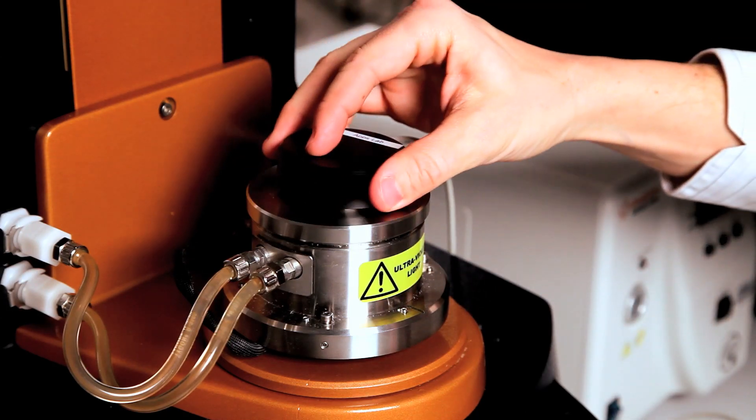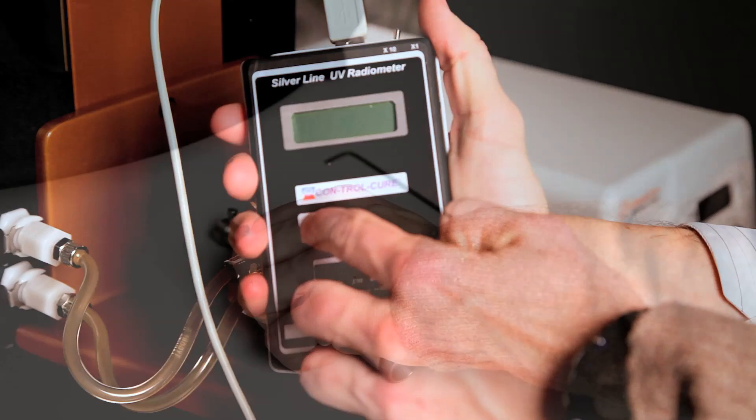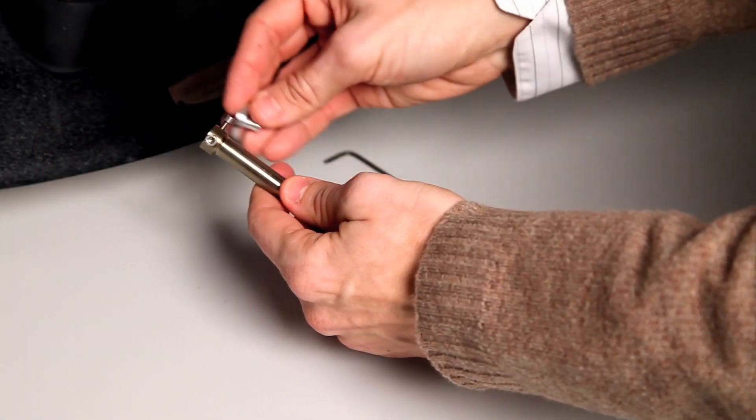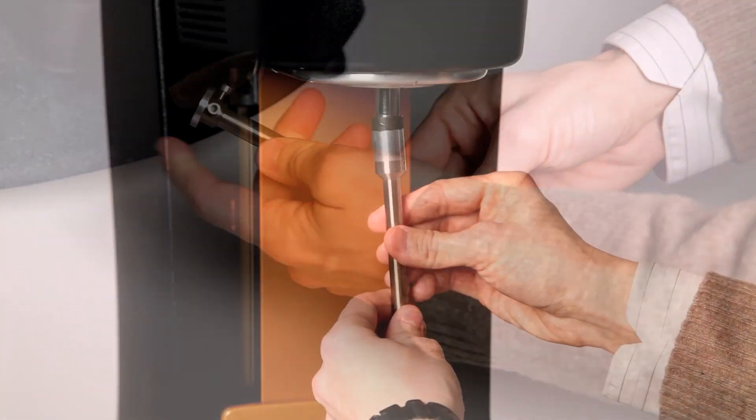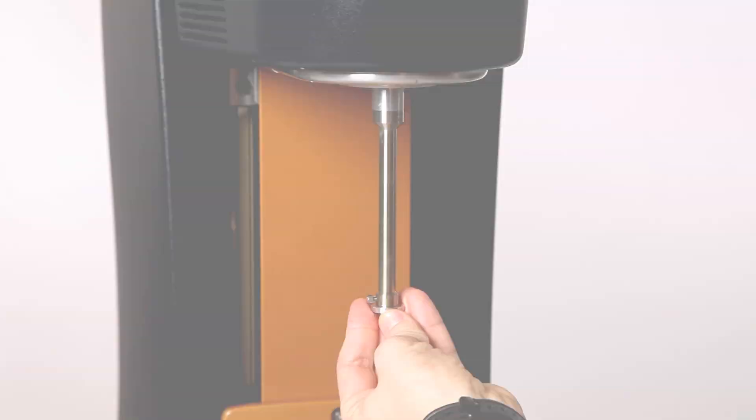Put the radiometer in place. Once the accessory is calibrated, we install the geometries.